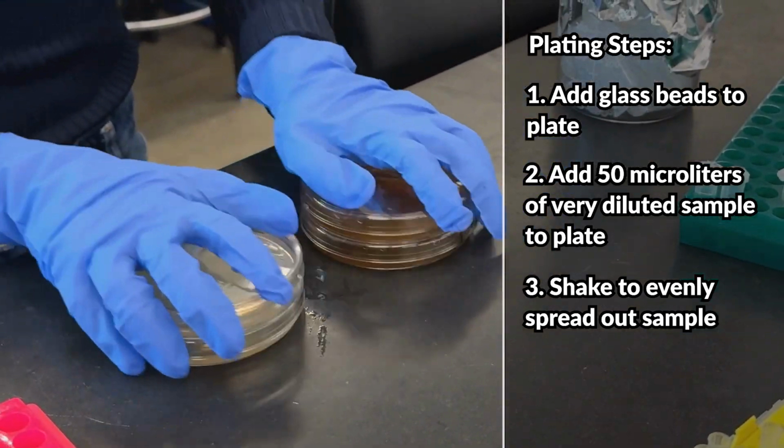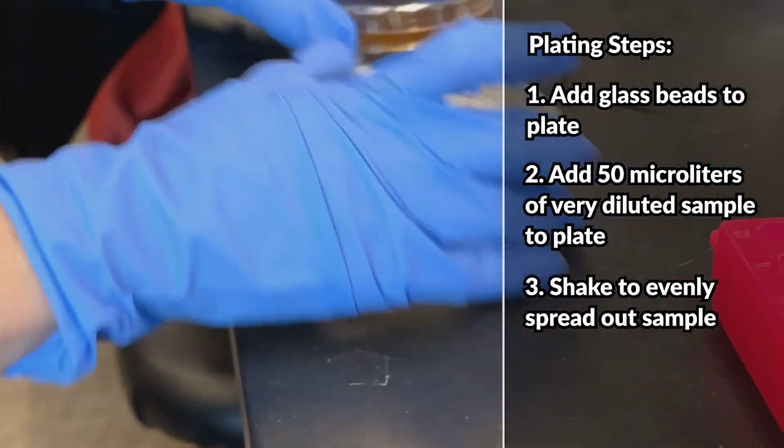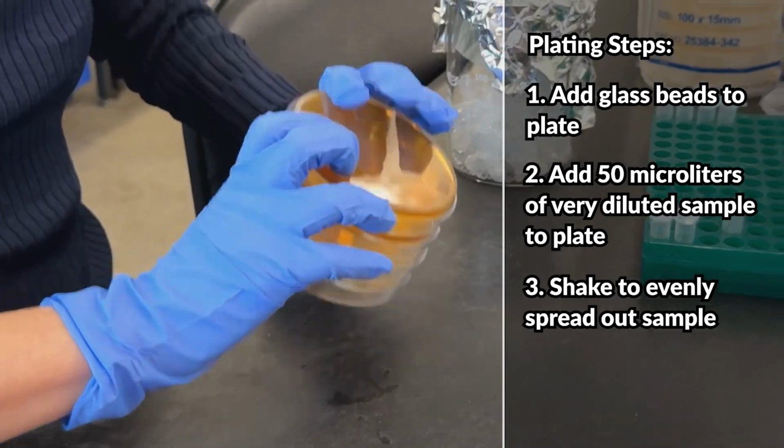You want to do this for about 30 seconds or so until the plates are dry. My arms hurt. Okay, that's how you know you're done. And now we're just going to repeat that.